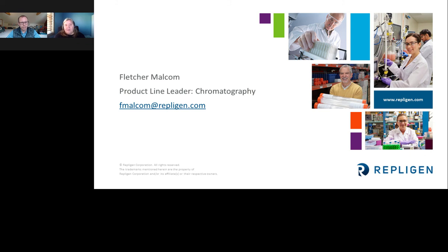Okay, and can the media be repacked in the same column, and if so, how many times? So once the resin is packed in the columns, generally it's there for the life of that resin.